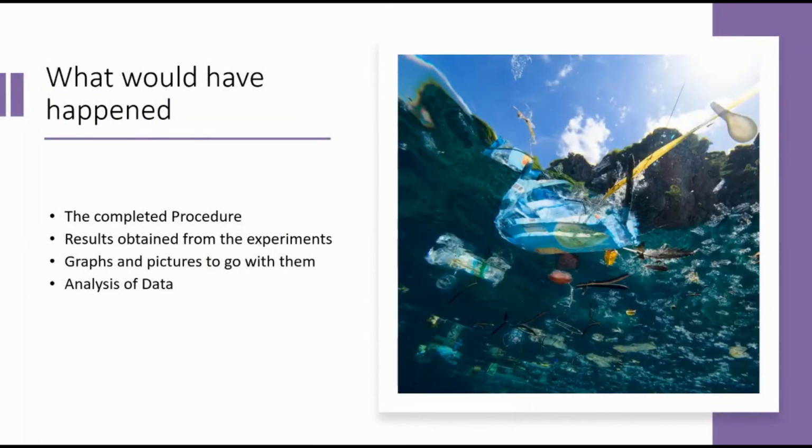Now what should have happened? Well, due to unforeseen circumstances, we couldn't finish testing. Upon the completion of testing, I could have shown you how certain samples would have looked during each phase. Theoretically, having done an experiment prior when assisting a fellow student, we know that the nitric acid would have looked similar to the hydrogen peroxide digestion. We also know from helping another student that the color change observed from the tests with enzymes would have been a brownish color. Tables and graphs would have been used to compare each digestion method with each other, most notably looking at their sizes, colors, possibly type, and how much was observed.